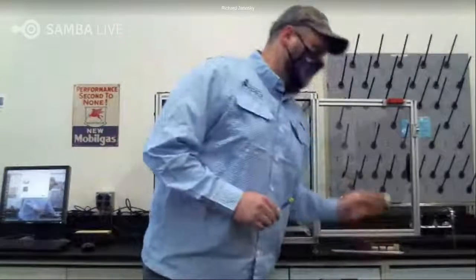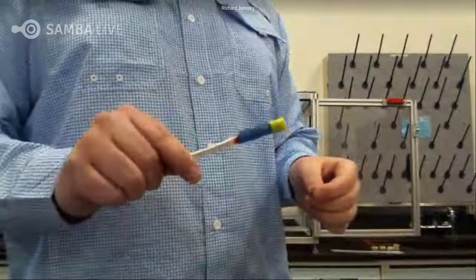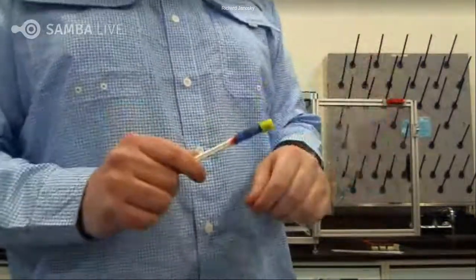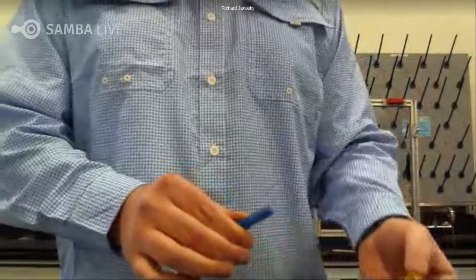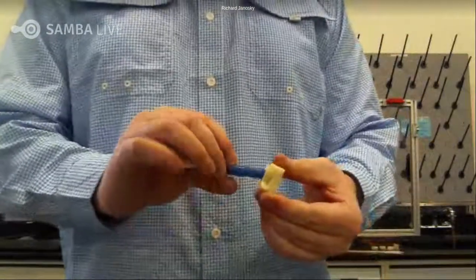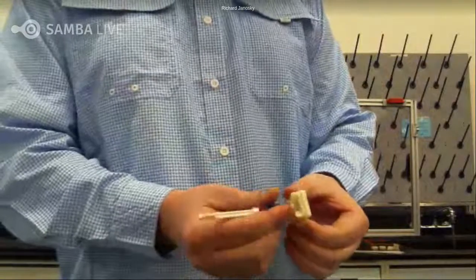When a sample arrives to the laboratory, it's in a closed position with its cap on. It normally is also in its travel tube. I've taken it out of the travel tube already. To prepare our sample, I'm simply going to take our cap off, and then we're going to thread our sample tightly on there.